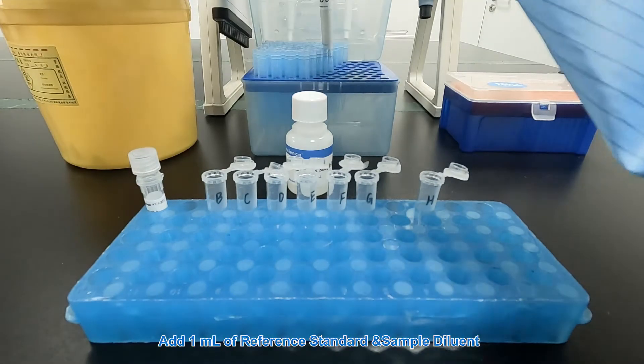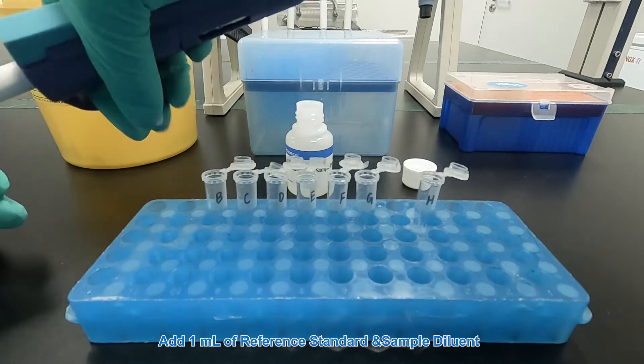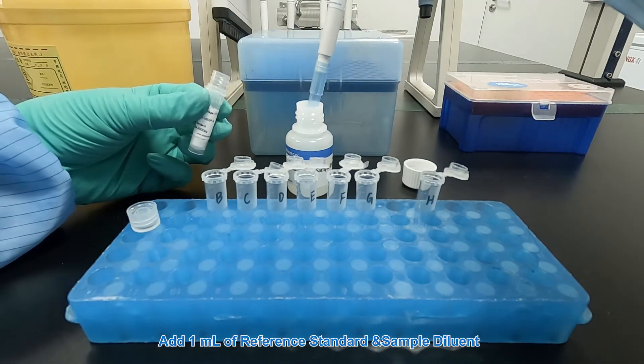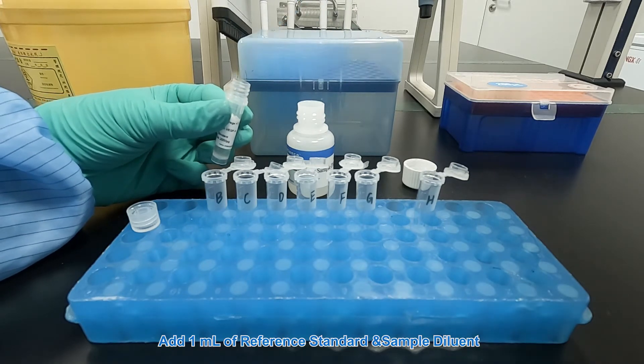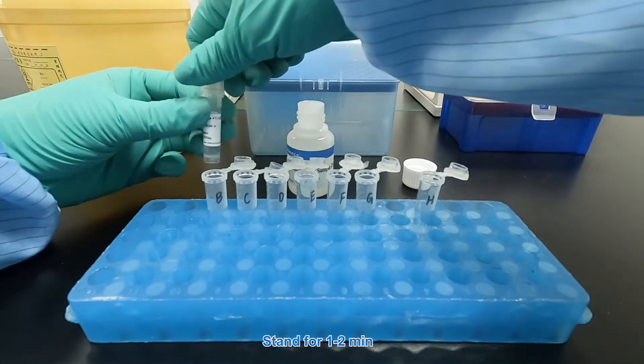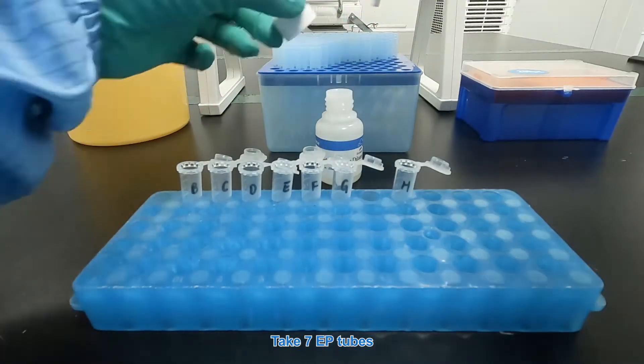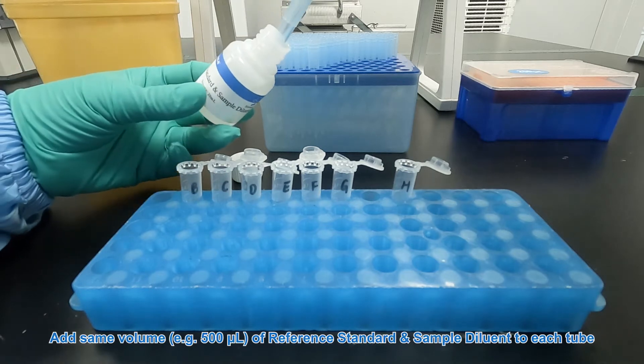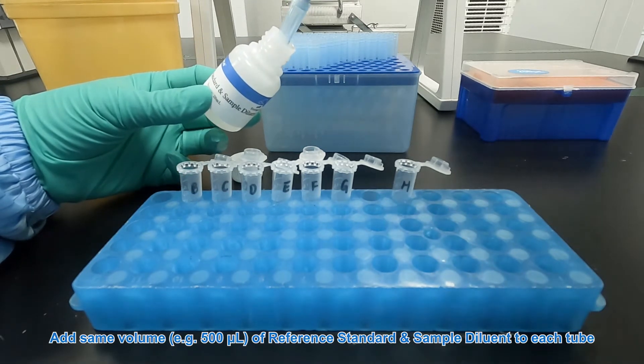Add 1 mL of reference standard and sample diluent. Stand for 1 to 2 minutes. Prepare 7 EP tubes. Add the same volume of reference standard and sample diluent to each tube.